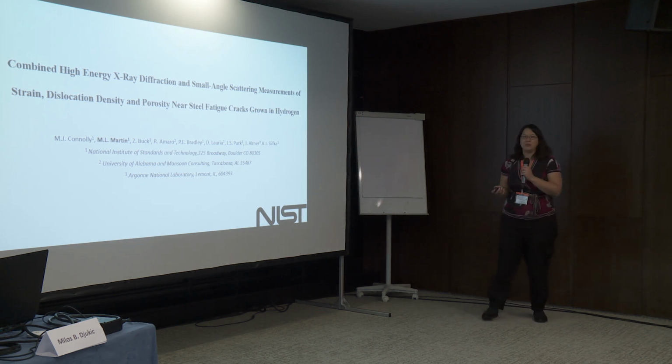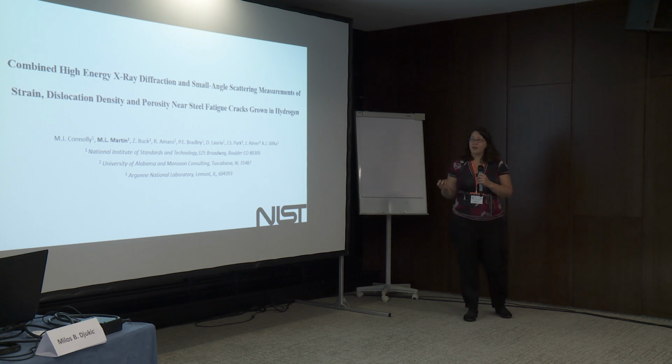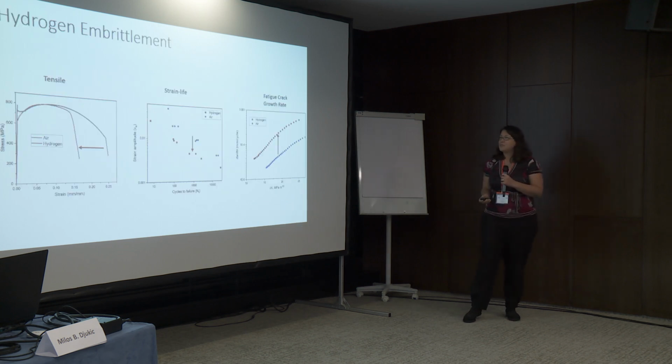For this talk, I'm going to present mostly the work of my colleague, Matt Connolly, looking at using high-energy X-ray scattering to look at several different features in fatigue cracks grown in hydrogen that allow us to explore the effects of different hydrogen embrittlement mechanisms.